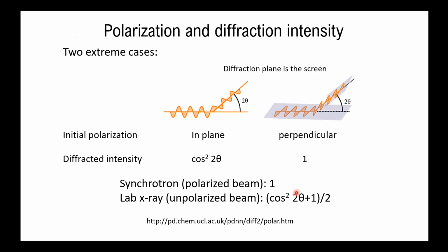I don't think that's a naive question. I think that's a pretty good one. My understanding is, we can also talk further on this, maybe even after this lecture. If you look at this case, you see the diffraction, the incoming one is actually in the inner plane, right? So it's kind of like a vector that will diverge into 2 directions.